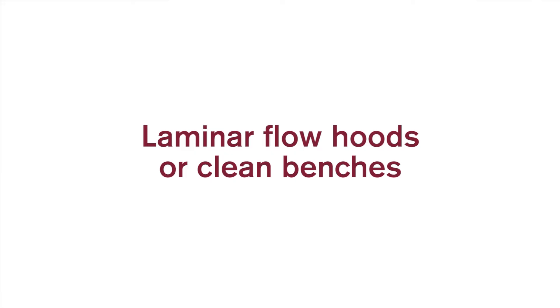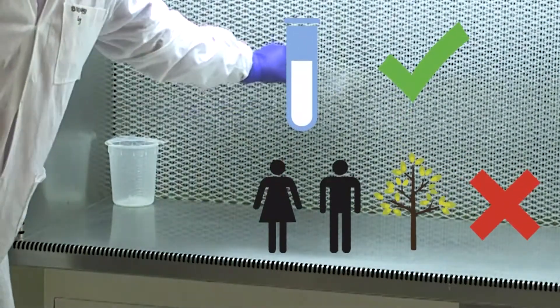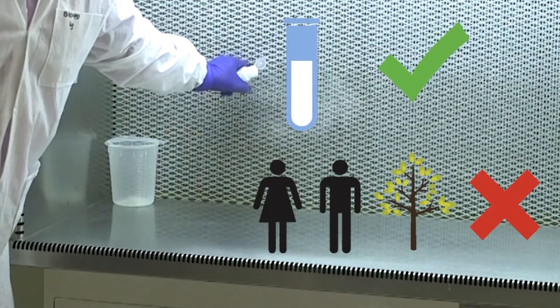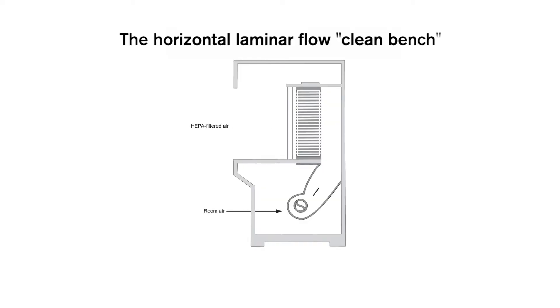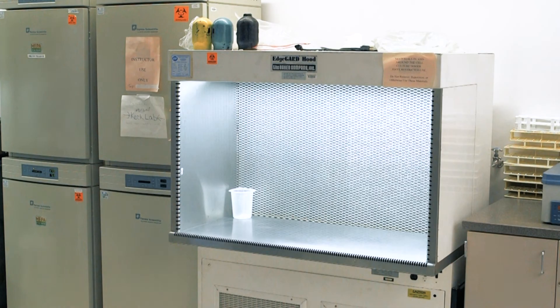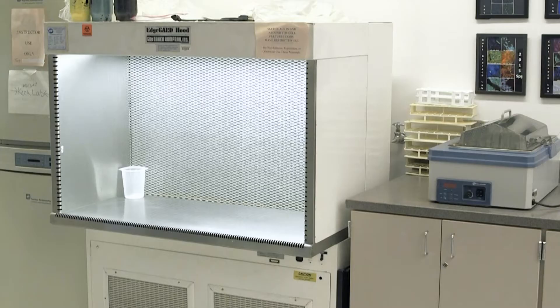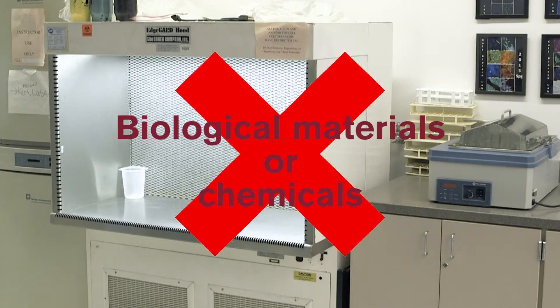Laminar flow hoods or clean benches. The laminar flow hood is designed for sample protection, but does not protect the user or the environment. Room air enters the hood from the bottom front or the top side, passes through a HEPA filter, and then blows over the work area towards the user. This hood offers sample protection and can be used when the sterility of the sample is important and the sample is not hazardous — for example, for microprocessors. Laminar flow hoods and clean benches should not be used when working with biological materials or chemicals.